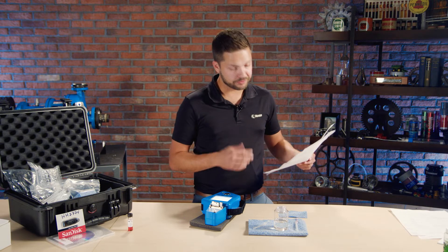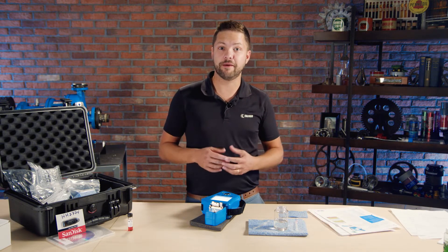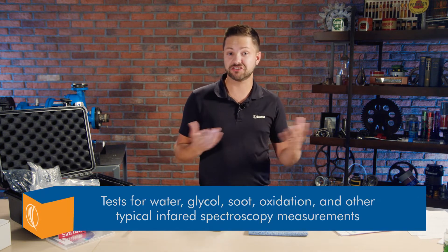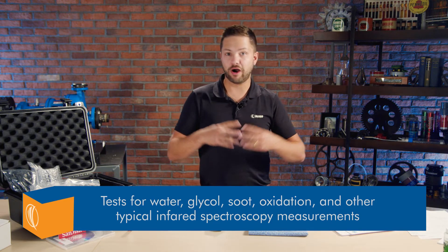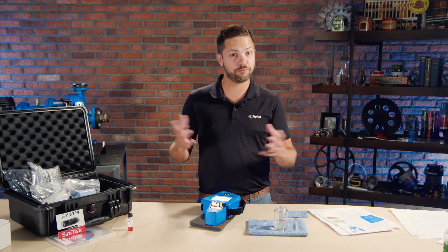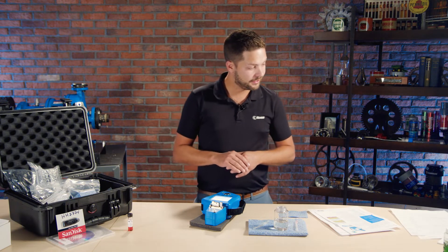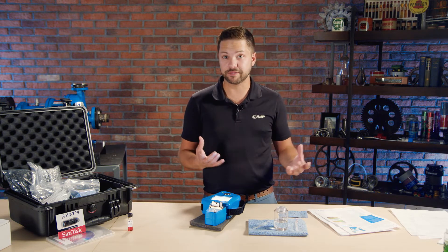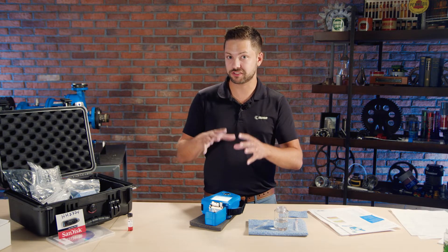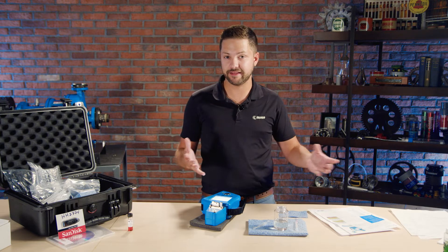As it's going, I'll talk about a couple of things. You'll see on the literature they provide and in the results that come up, it tests for all the typical infrared spectroscopy measurements — contaminants like water or glycol if it's an engine, soot as well. Oxidation, nitration, sulfation — oxidation in particular is important for gauging the overall condition of the lubricant. It's already at 75%, almost done. It also looks for additive depletion, like anti-wear additives depleting over time. Infrared is looking at the molecules, which is a little different than elemental spectroscopy, which looks at the elements themselves.